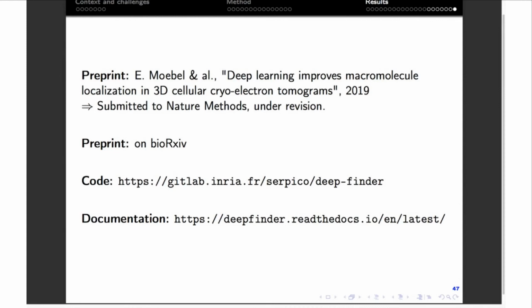So it is true that when you train a neural network, negative examples are as important as positive examples, also because the negative class can have much more variability. But in this case, the patches are large enough to include enough negative examples around the macromolecules. So it was not necessary in my datasets to sample patches with only negative class. I hope that answers the question.